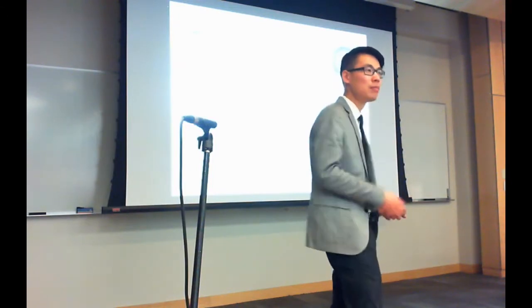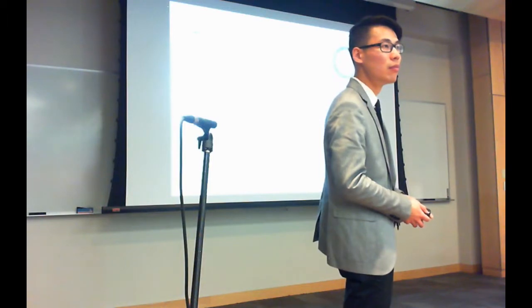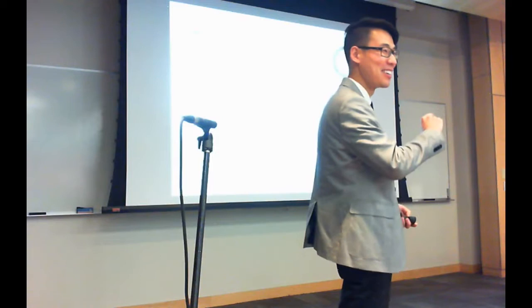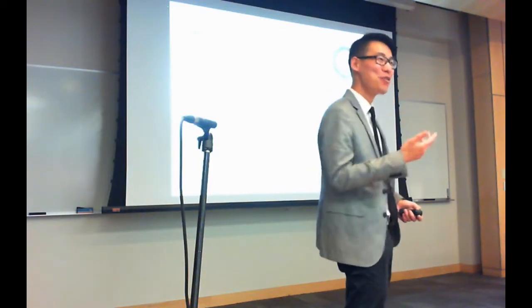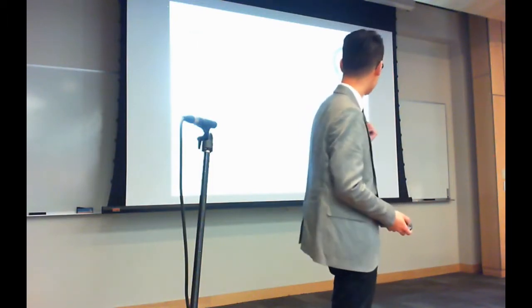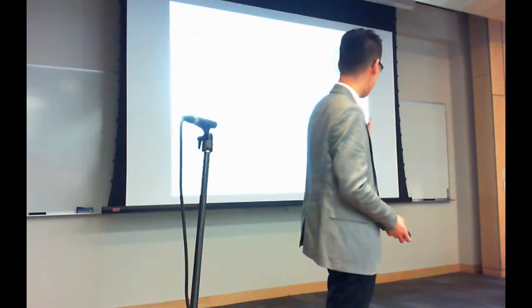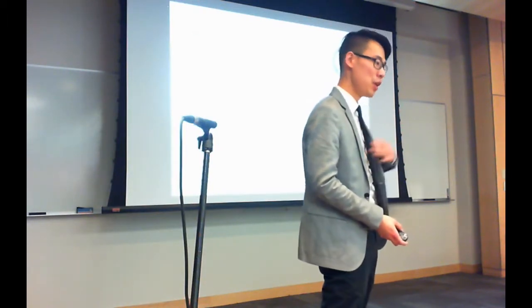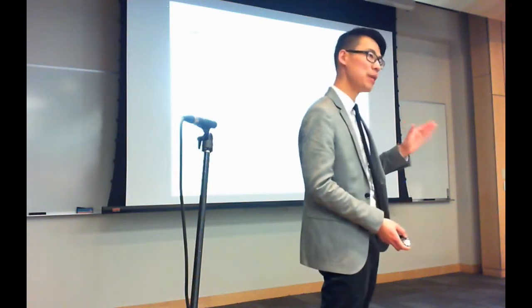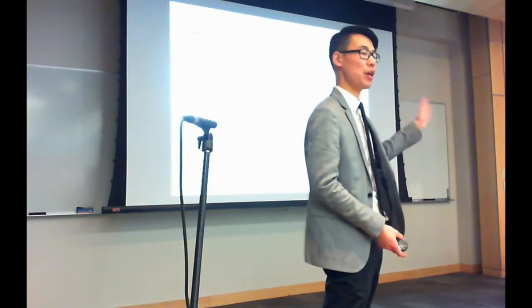Danny, did you benchmark the identification rates from the spectral libraries in comparison to database search? Nuno just asked me that right before the talk. I don't remember the numbers for this particular data set, but compared to the published results from the original lab that generated this data, I think we have maybe a 25% increase in identification rates at the PSM level.